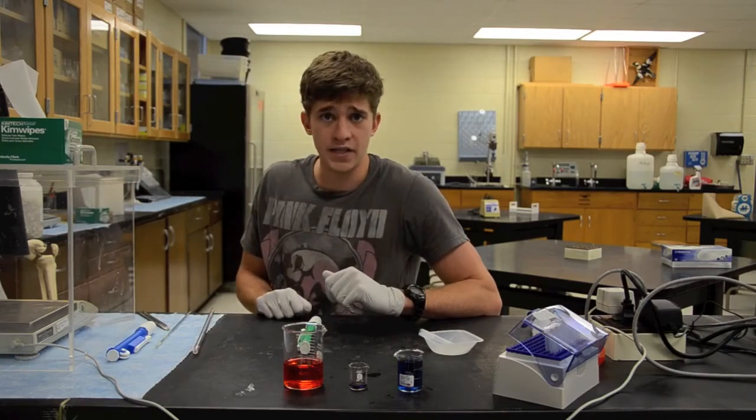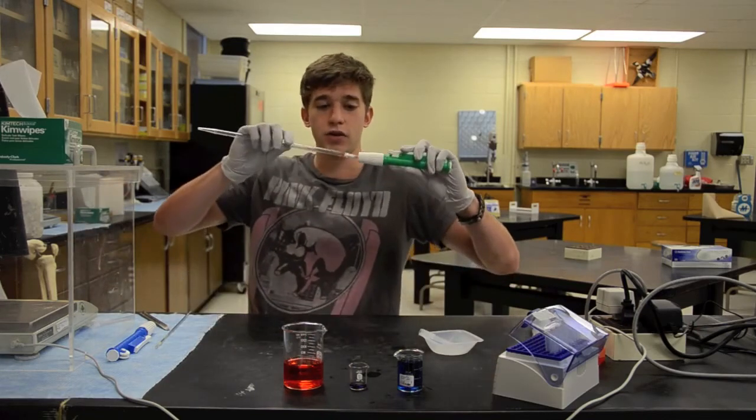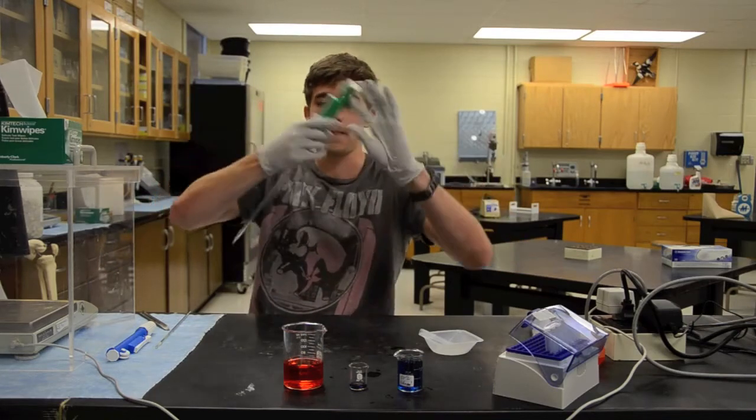Now connecting the pipette, you might be wondering if that's difficult. It is not. It's a very simple technique. You hold it up to the pipette you want it to go into, and you just press it in like that. That's all there is to it.